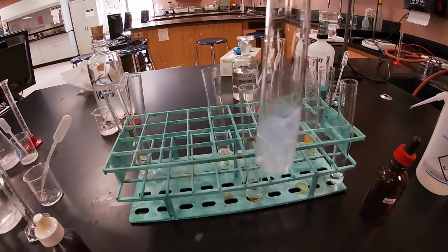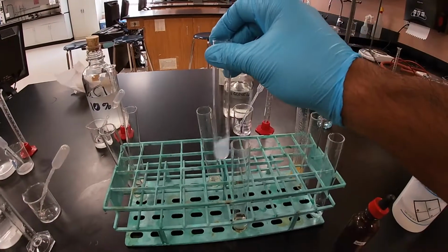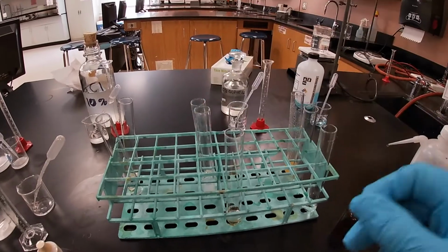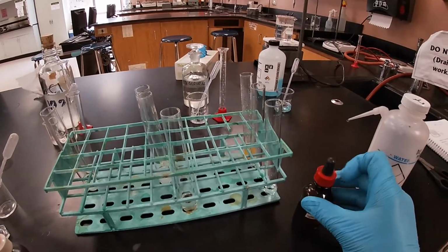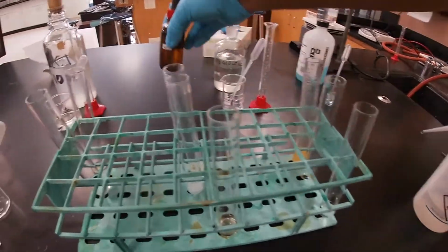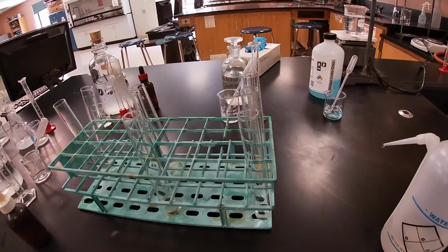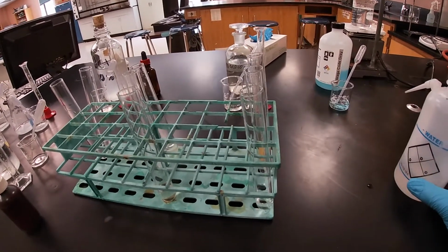Well, it got cloudy, but that's about it. We see no precipitate. I got a little bit cloudy, right? And let's go ahead and try our last solution. We're gonna measure out, I'm assuming, 3 milliliters of our Benedict's solution.